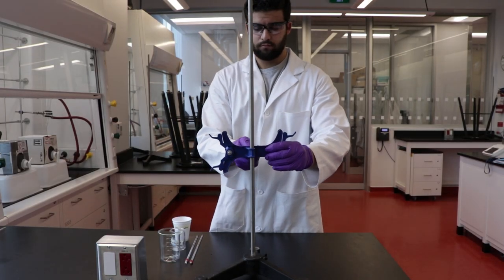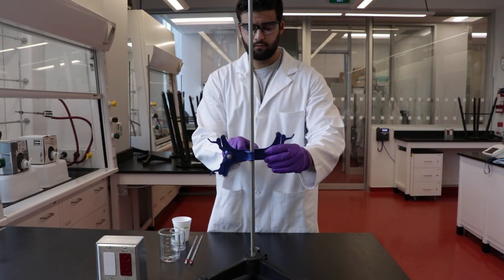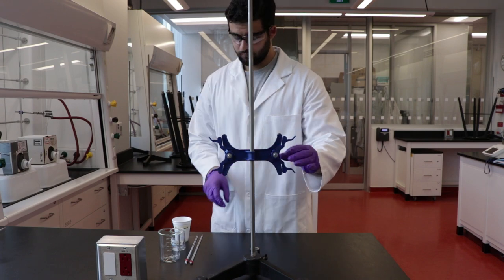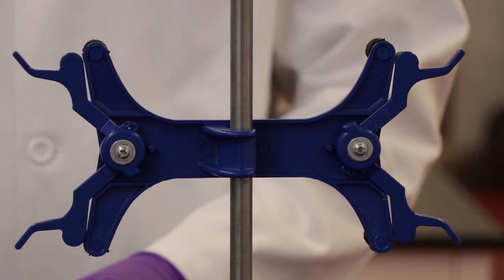Begin setting up the calorimeter by putting the burette clamp on the retort stand. Clip the thermometers into the clamp.